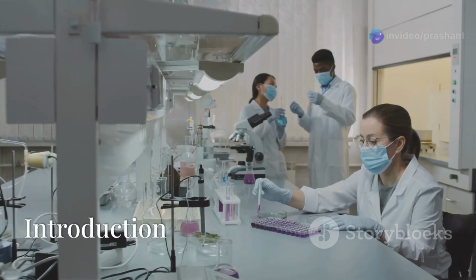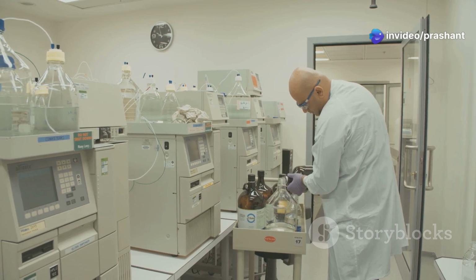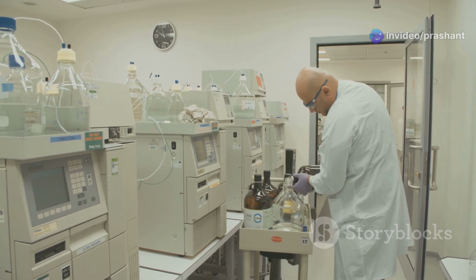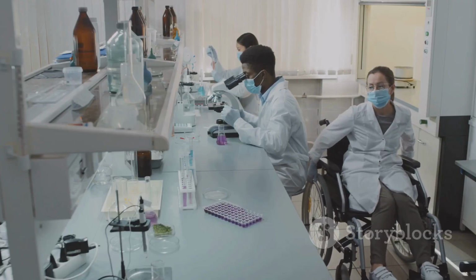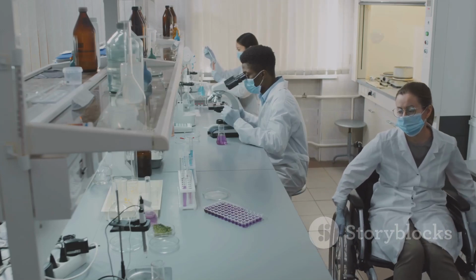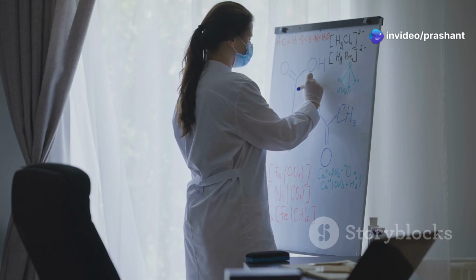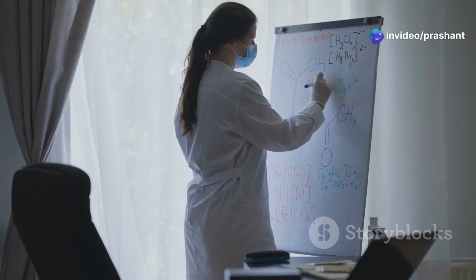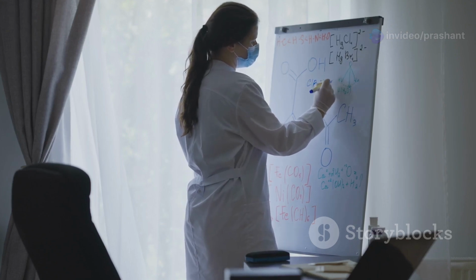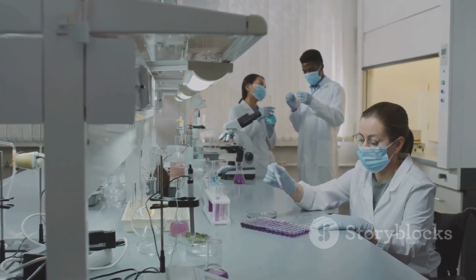Hello everyone, welcome back. In today's video, we're diving into an important topic for your curriculum, electrophoresis. This technique plays a key role in instrumental methods of analysis and is widely used in pharmaceutical research and quality control. By the end of this video, you'll have a clear understanding of what electrophoresis is, how it works, the different types, and why it's so essential in the pharmaceutical industry.